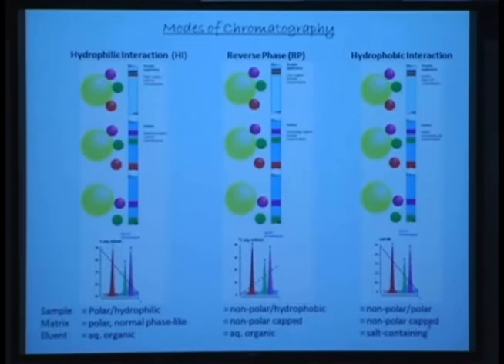What is typically done is you start with a very high concentration of the organic solvent. In this particular case, for the most part, we use acetonitrile. You can also use methanol. Now these high organic solvents would force the interaction, which is why we typically use a very high concentration of the organic solvent. So those molecules that can interact with the polar medium would interact with it better, and as the concentration of the organic solvent decreases, you would see resolution based in essence upon competition.